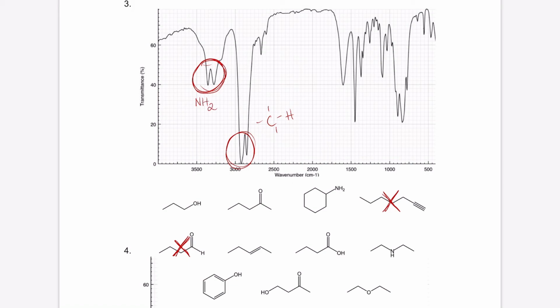So what we should be looking for to match this spectrum is an amine, a primary amine. And again, we know it's a primary because we have 2 hydrogens, so it should be 2 peaks. If this was a secondary amine, where our nitrogen is only connected to 1 hydrogen, we would only have 1 stiff peak in the 3300 to 3500 wave area. But because it's a double peak, 2 hydrogens, primary amine, which leaves us with this compound as our answer.